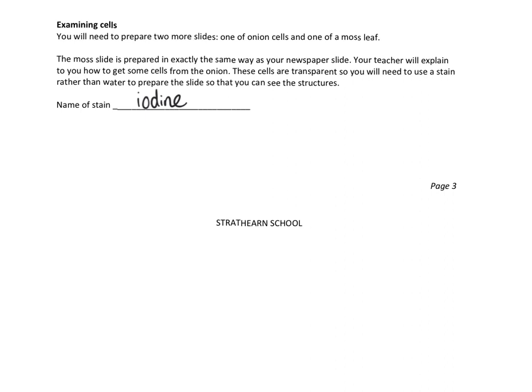So rather than using water like we did for a newspaper to get the little cover slip to stick down and to coat the sample on the slide, this time we're going to use a stain called iodine.